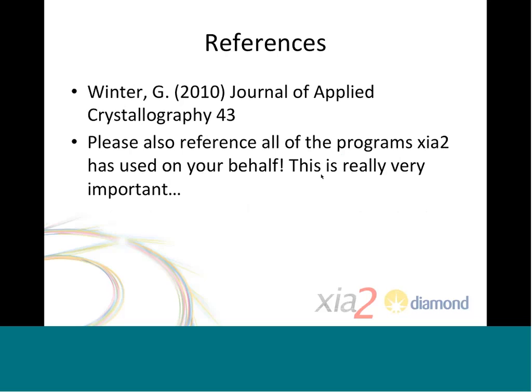Okay, so there was a XIA2 paper a few years back, which I saw was listed actually from the webinar advert page. That's also listed in the XIA2 output. But as I say, I would really appreciate it if XIA2 users, when you come to publish any results where XIA2 is used to reduce the data, it is very important that you include references for all of those programs that XIA2 has used on your behalf.